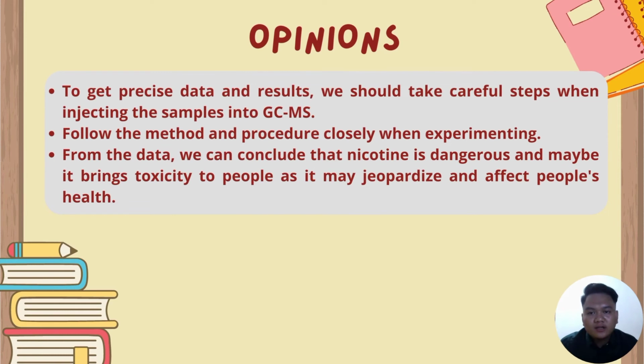In my opinion, to get precise data and results, we should take careful steps when injecting the samples into GCMS. Follow the method and procedure closely when doing the experiment. From the data, we can conclude that nicotine is dangerous and may bring toxicity to people as it may jeopardize and affect people's health.